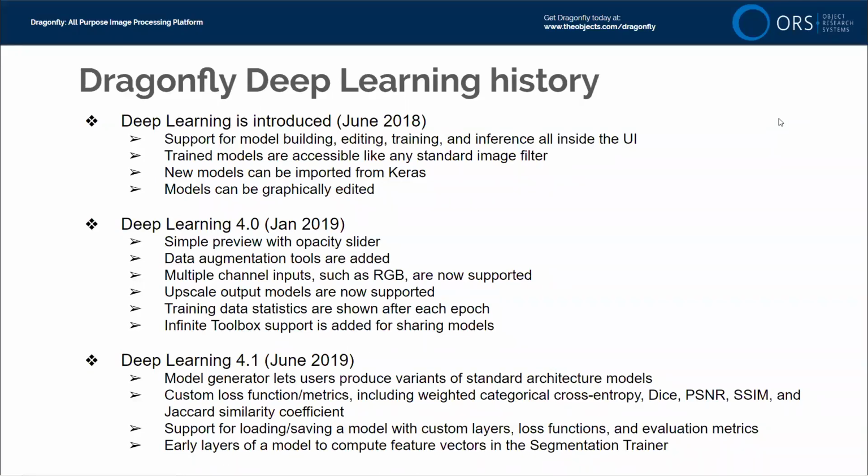We have a tool in Dragonfly that we haven't shown yet. If any of you have ever used Weka from Fiji, it's a very powerful tool that uses random forest machine learning libraries for an automated segmentation. It doesn't use deep learning, but it uses random forest machine learning. We also have a method like that. We haven't shown it at all in this tutorial series.